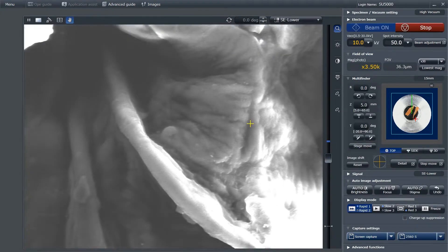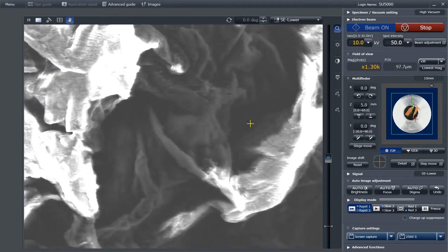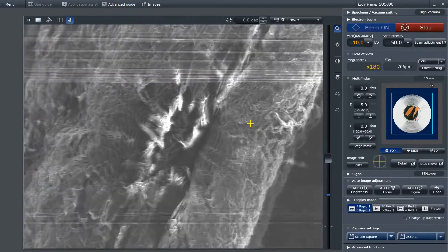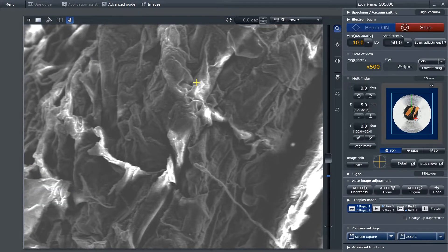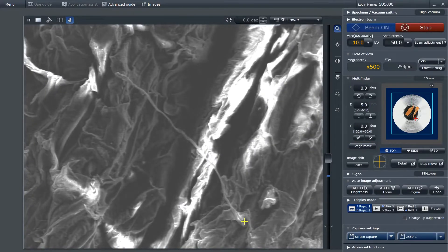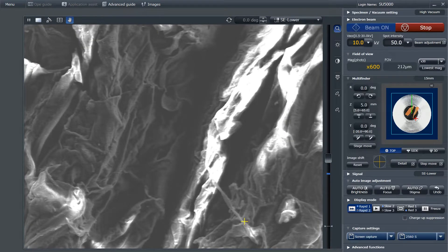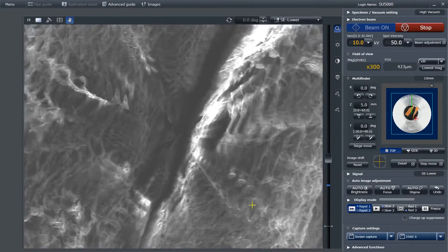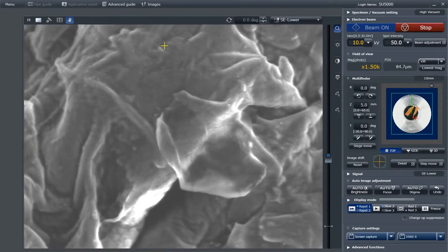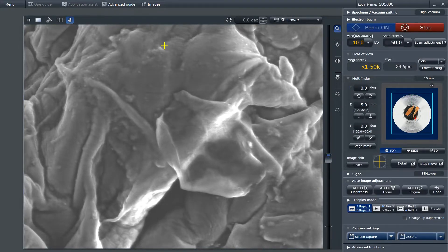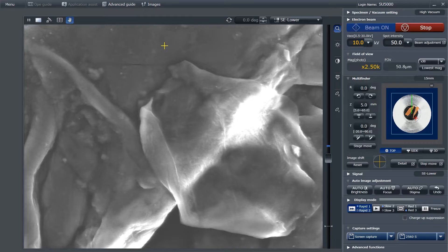And you'll notice that the actual surface of the carrot starts to expand as I radiate it. Because of the charging of that thin slice of carrot, it wanted to move toward an area of net positive charge, since we were radiating it with electrons which carry a negative charge. You will also notice once again as I zoom in here, that the surface of the carrot begins to expand, presumably due to the liquid inside boiling.